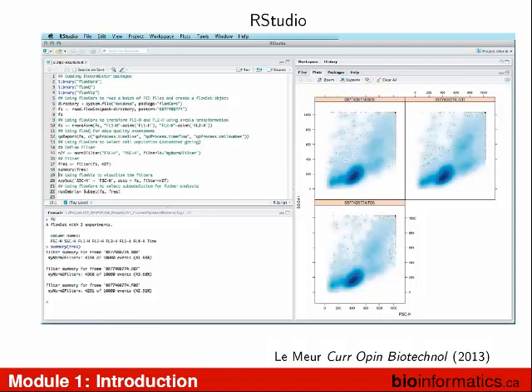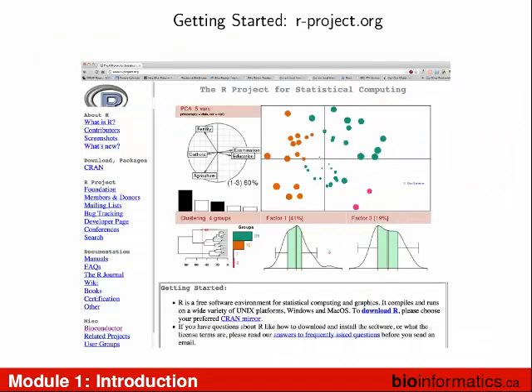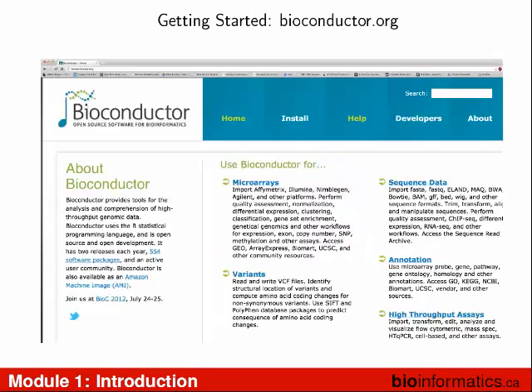This is a picture from Noelle's paper. So for those of you who are working at home, all this stuff in our project, this is where you go get the stuff. It's statistical programming, lots of different tools to do lots of different things, most of which you don't care about. Within R, there's a subgenre of stuff for biological analysis. So I talked about microarray sequence analysis. Down here on the bottom, high throughput assays, we live in here, flow cytometry data. So you click on that.